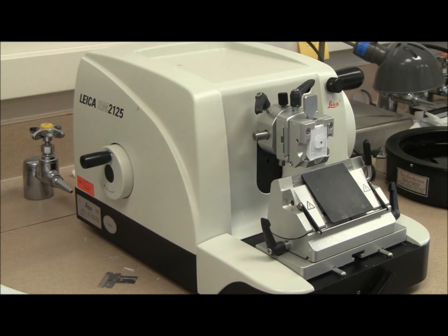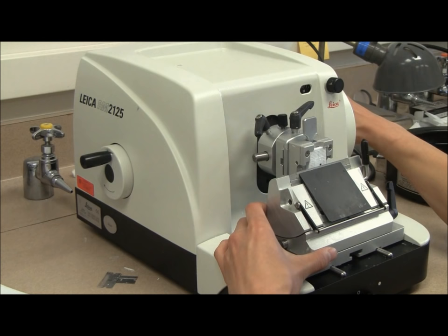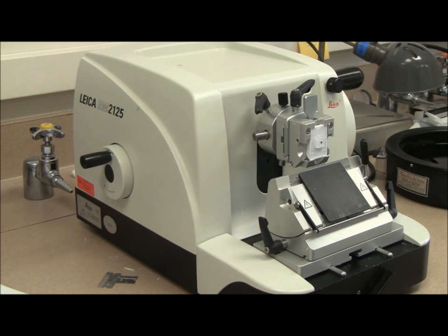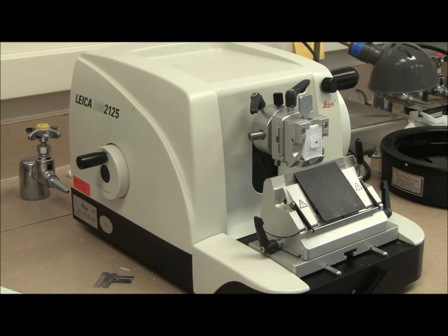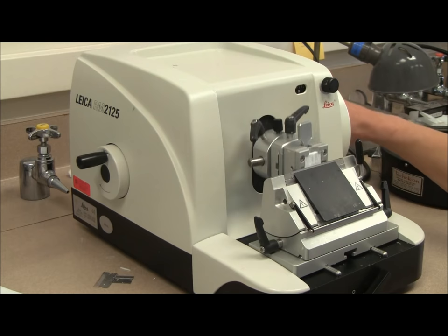Once your block is secured to the specimen clamp, adjust the knife holder to get the blade as close as possible to your block. This can also be accomplished by using the coarse feed wheel. Set the thickness indicator to 10 micrometers and begin cranking the hand wheel.